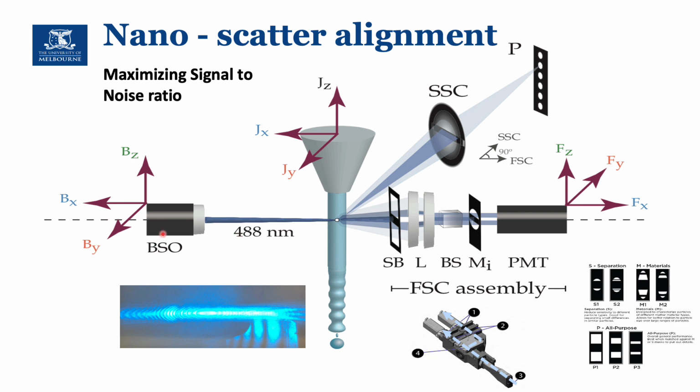The BSO, the beam shaping optics, are the optical elements that shape the beam and focus the beam right where the particle is flowing, and also align the jet. So it was a multi-aligning procedure that typically takes like 20 steps to try to find the limit of detection in terms of scatter of an instrument like the Astrios.